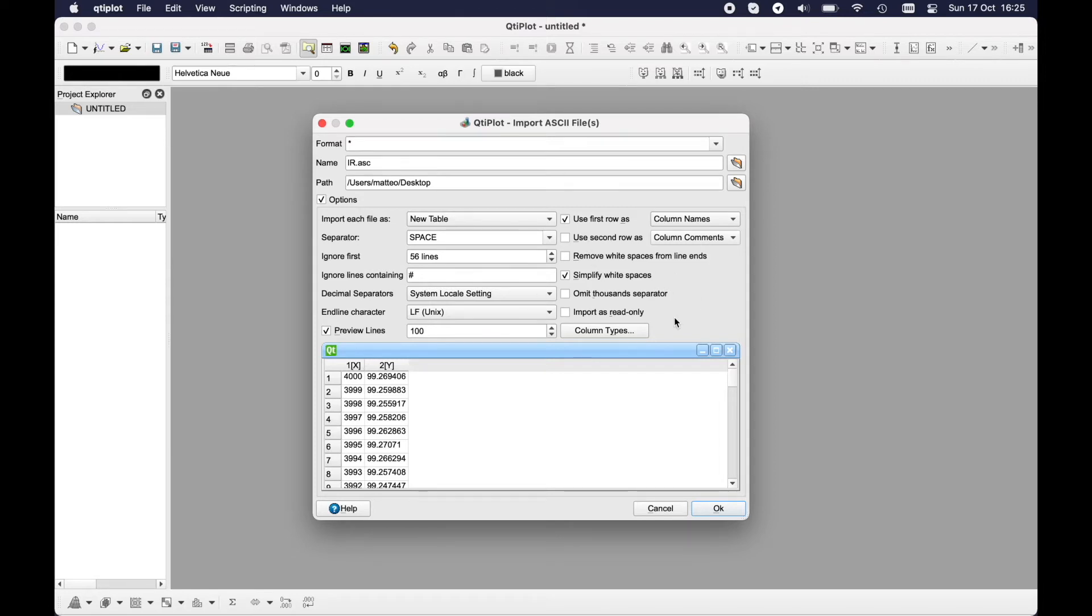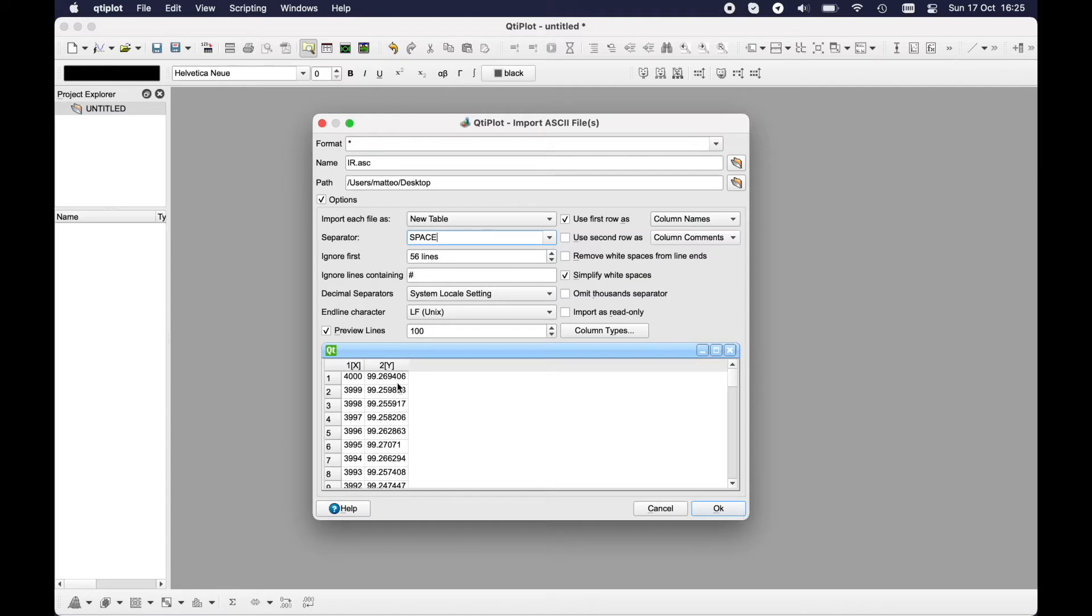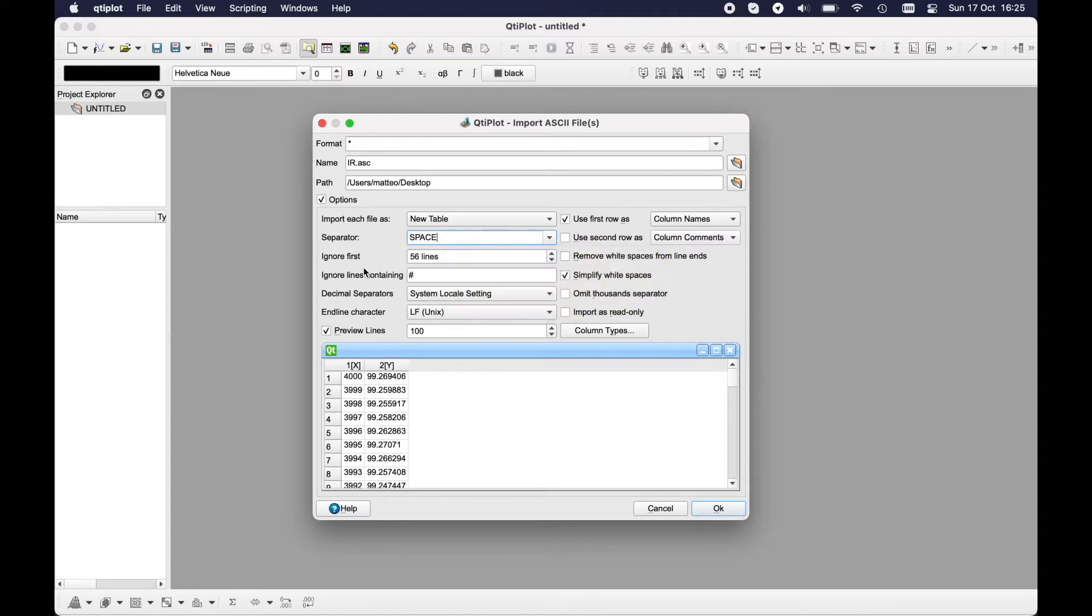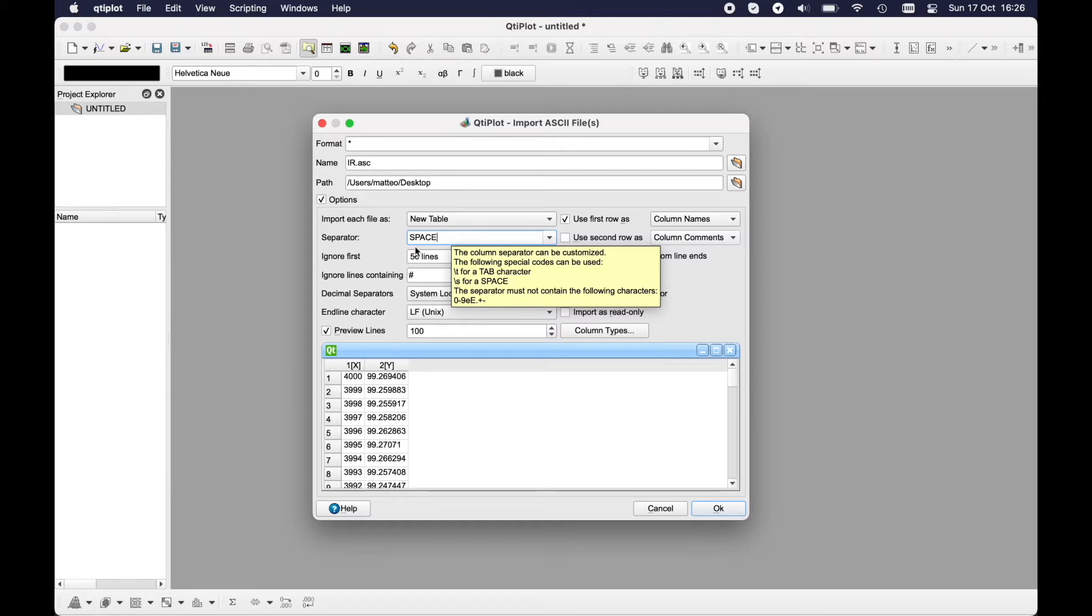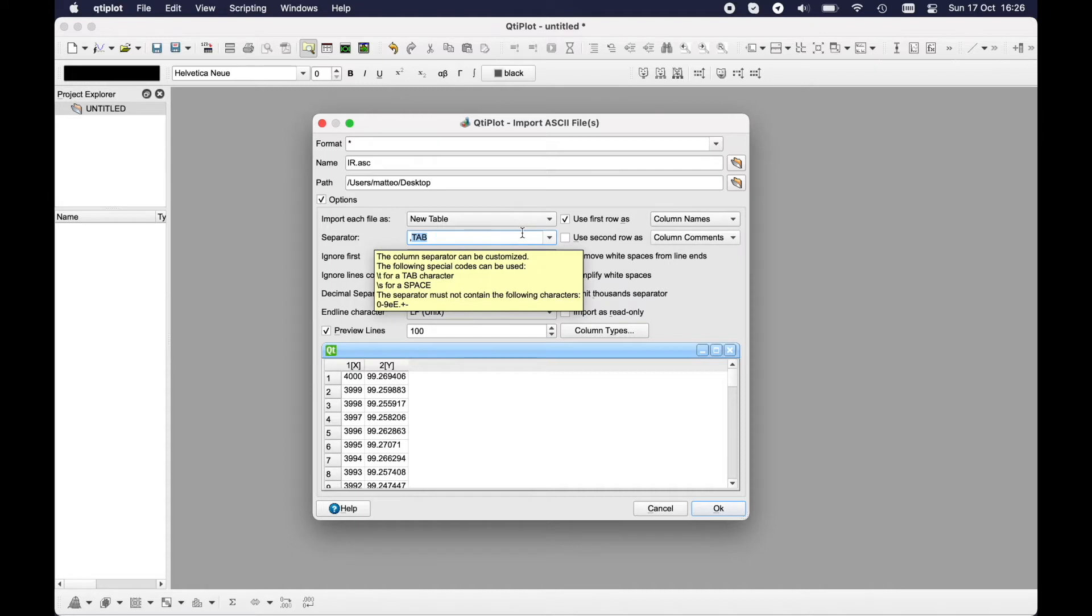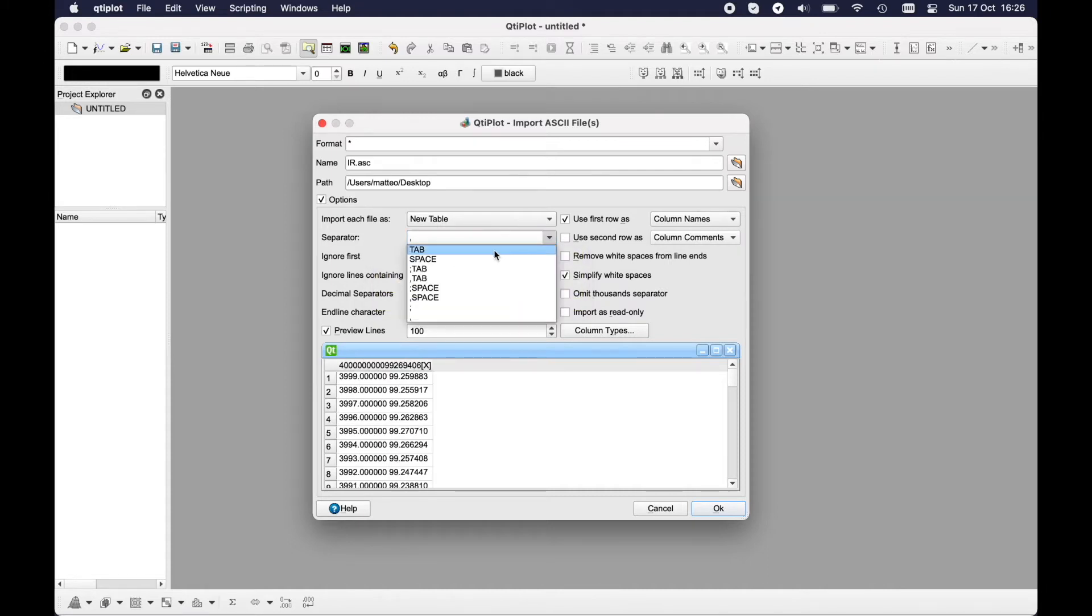Then you have the separator. In my original file I have the space as column separator, but if you have for example a CSV that you can obtain from Excel or other kind of separator, you can use for example slash t for tab or the comma for CSV or other kinds of separators.